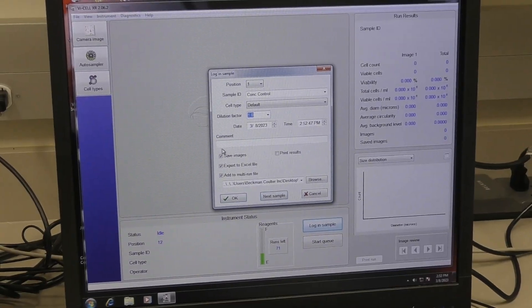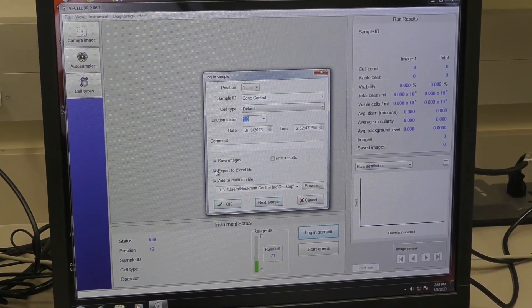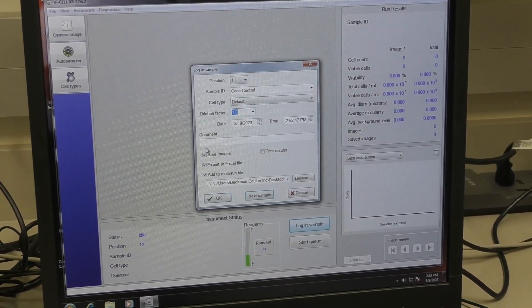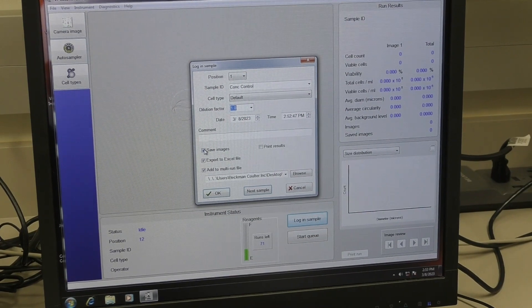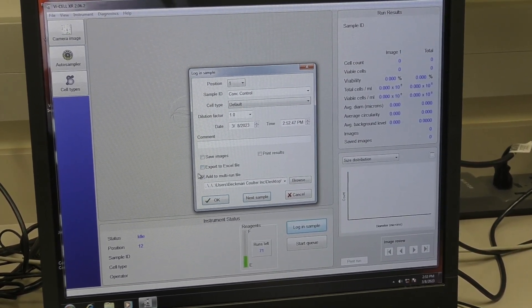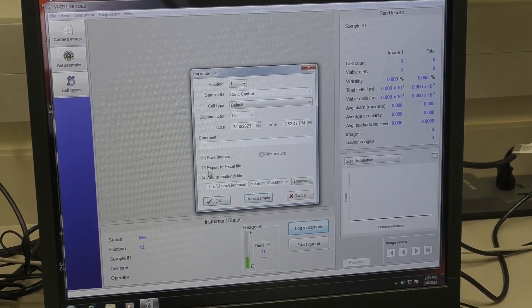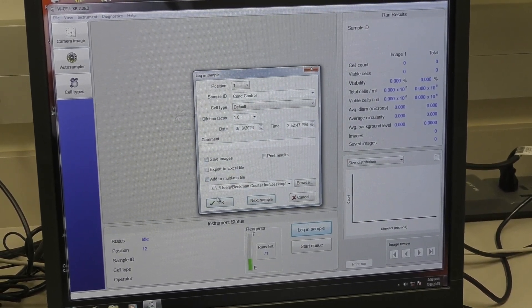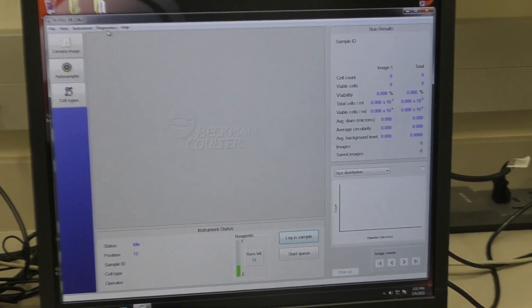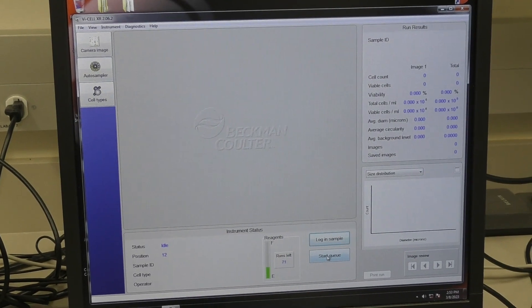If you wish to save the images and the data in an Excel file, leave these boxes checked. If you do not, uncheck these boxes. If you have a lot of samples and want a multi-run file, leave this one checked. Say OK, and then to run, start the queue.